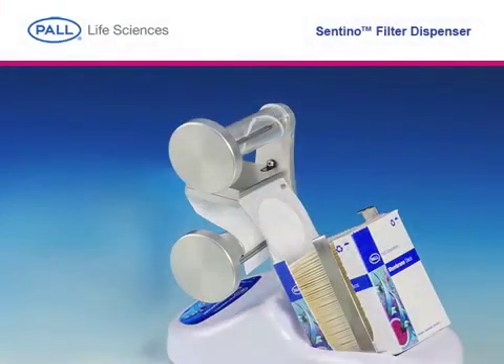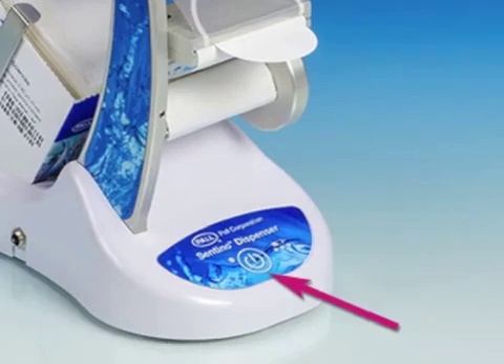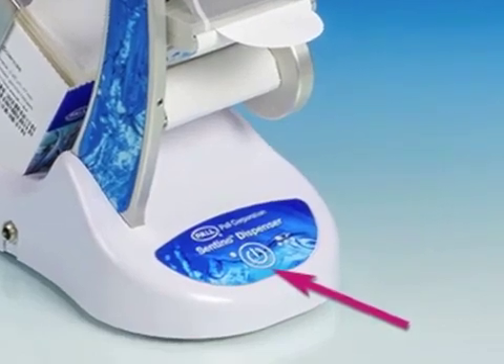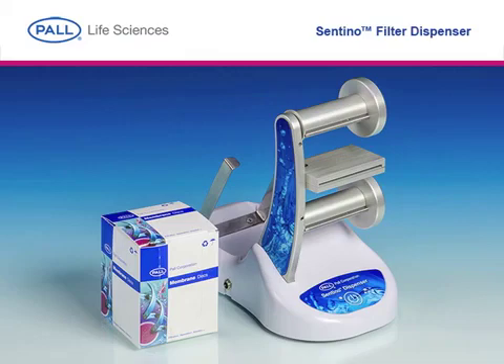Adjust any slack in the refill web by manually turning the spools using the retainer clip knobs. To aseptically dispense a single disk of membrane, simply press the dispense button. The Sentino Filter Dispenser — ideal for any busy laboratory.